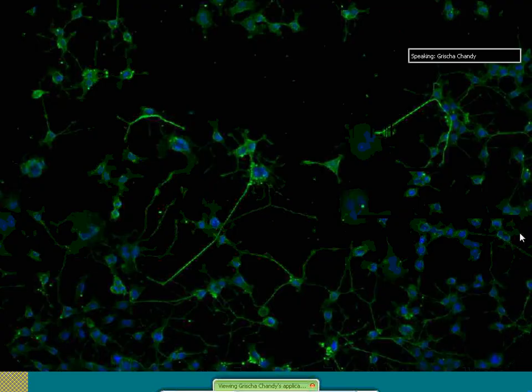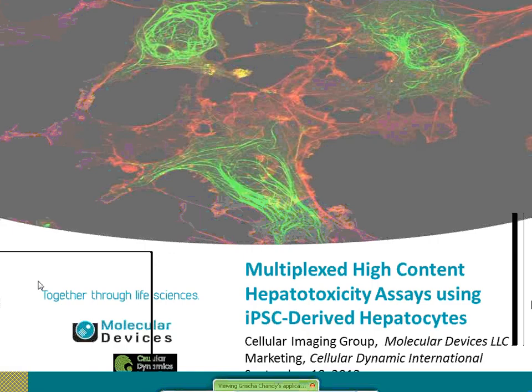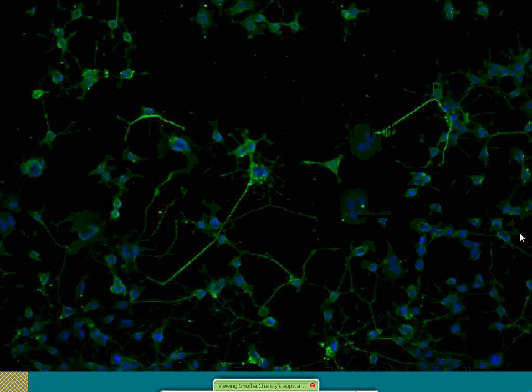Oksana, a question for you. In your screen, how many compounds were controls expected not to have any toxic effects? In this particular library, which actually we didn't design, we get it from Enzyme Company, it was 30 non-hepatotoxic controls and also some empty wells across the plate. So I would say like 30 versus the other total 240. Okay.